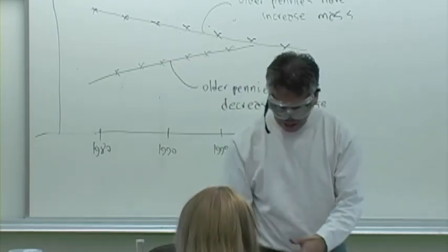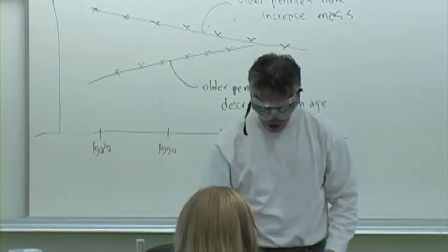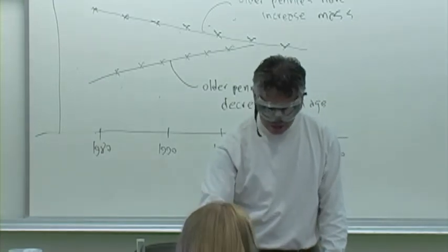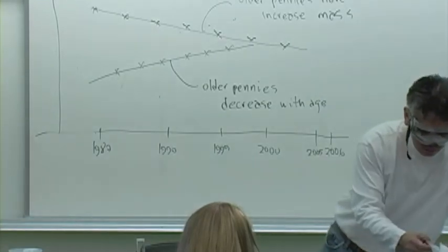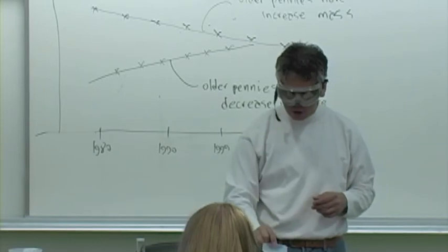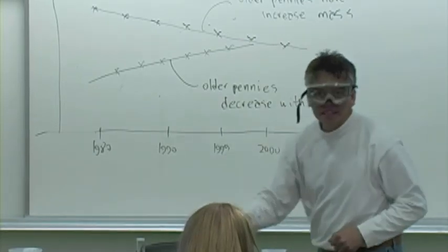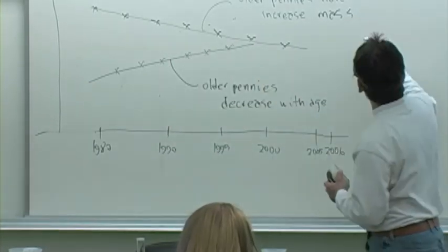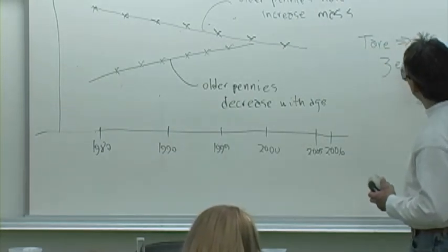What you want to do is use the balance, and you guys are going to use this for the first time. It'll generally be on, but make sure that it's on, and then there's a weighing boat in each balance. What you want to do is just place the weighing boat on the balance, and then tare it. Not tear, but tare, T-A-R-E. Tare simply means to zero the balance.